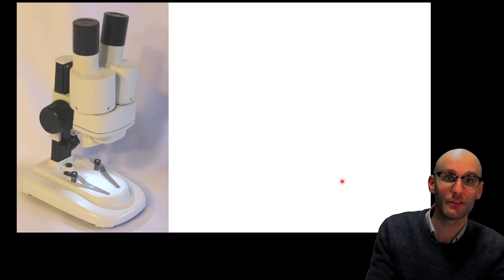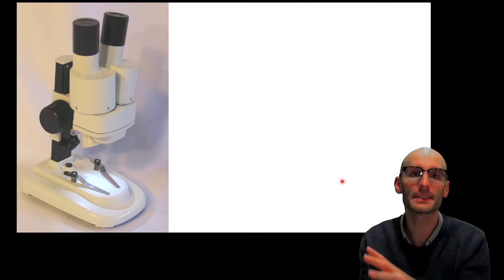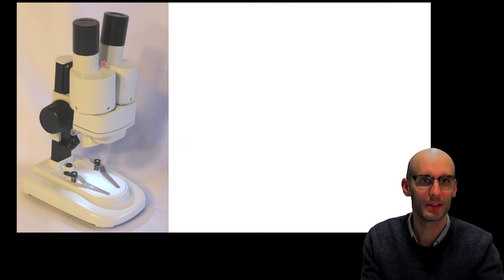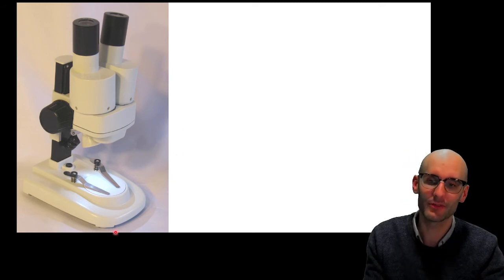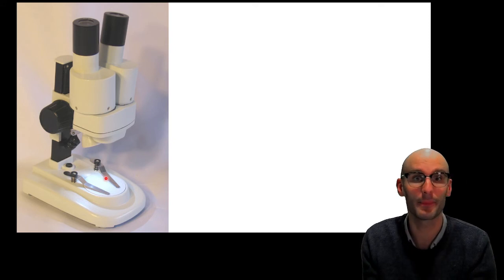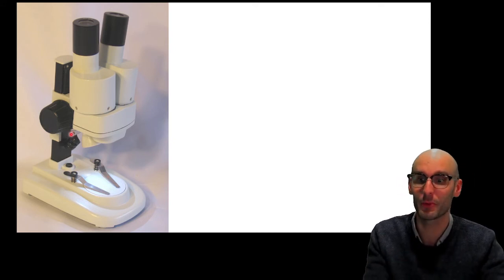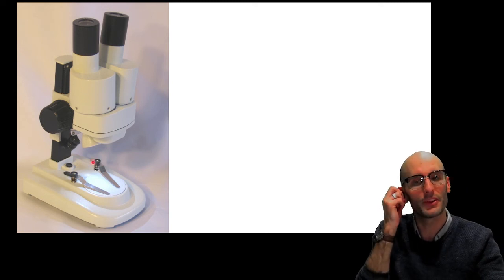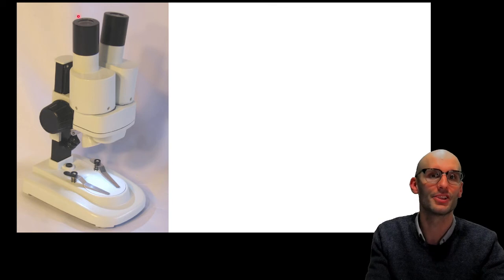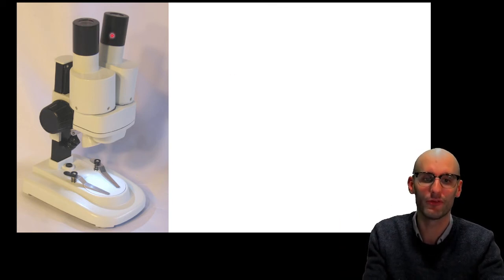Now there's another kind of electron microscopy called scanning electron microscopy, and it's very similar to another kind of light microscopy. This is called a dissection light microscope, and instead of light coming through the tissue, which would be very difficult if you were dissecting something or doing surgery on something, because light can't get through tissue very well, instead the light comes from the top. It then hits it and is scattered and redirected up into the microscope, focused via lenses, and then viewed.